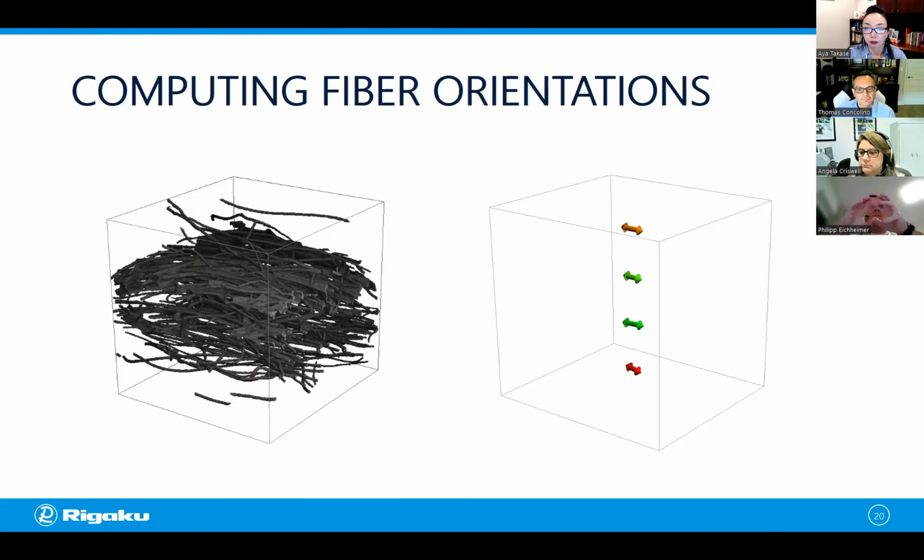And then from the smaller scale, we average them up to the larger scale. Each block has an orientation, and then we average these over all the other blocks, and then for the entire domain. So from a small scale, we then go back to the larger scale again. And then the first one goes per voxel, goes through each sample, and has this orientation method. Excellent.